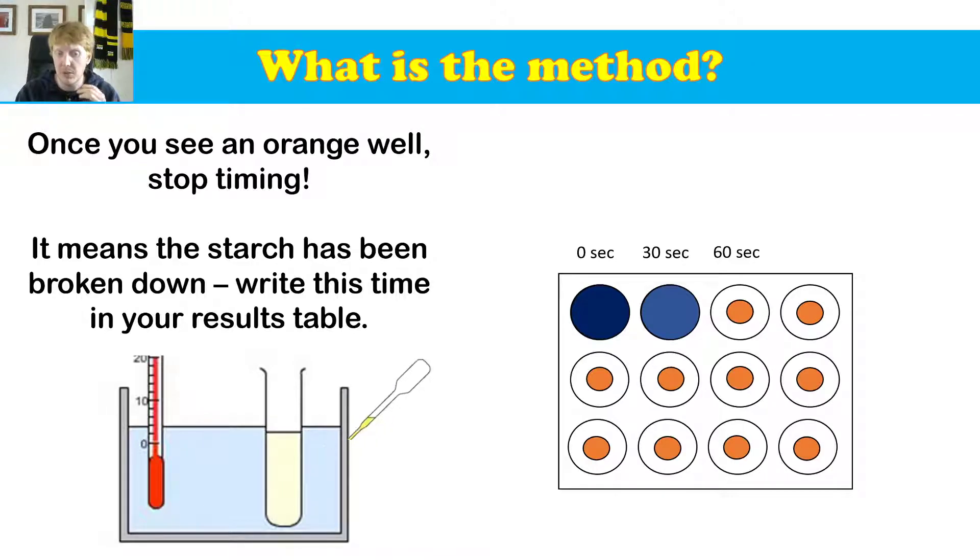At 60 seconds, we do the same thing. We take another drop out of our solution. It's starting to get even lighter still. At 90 seconds, we take another drop out and pop it down.